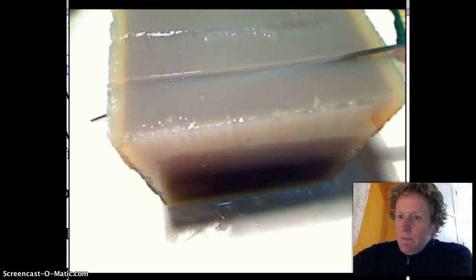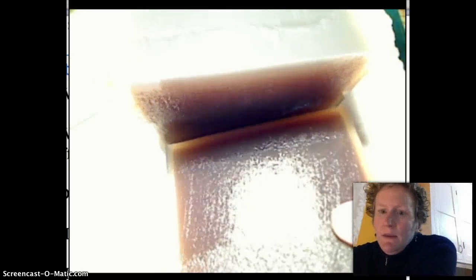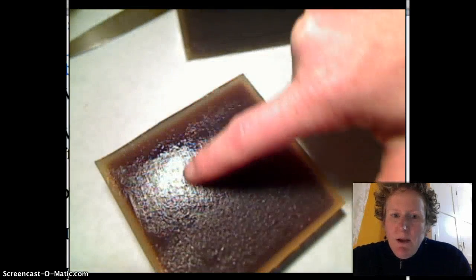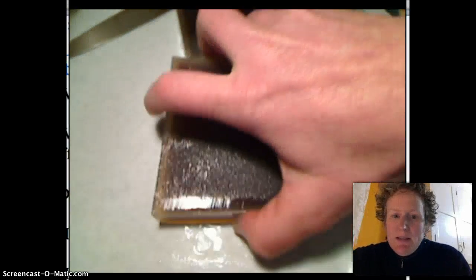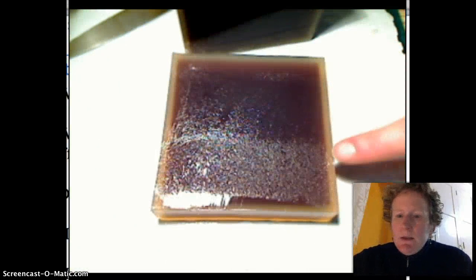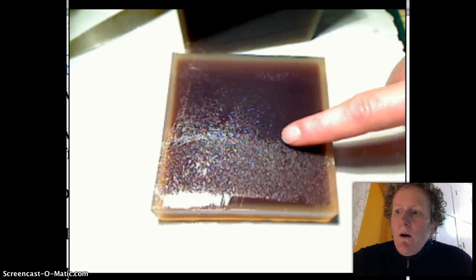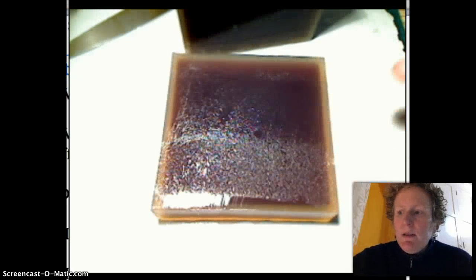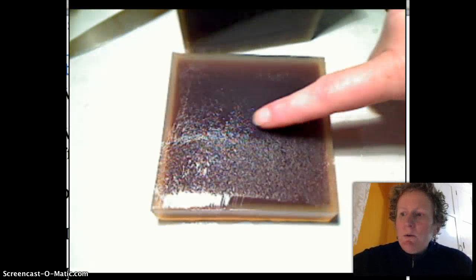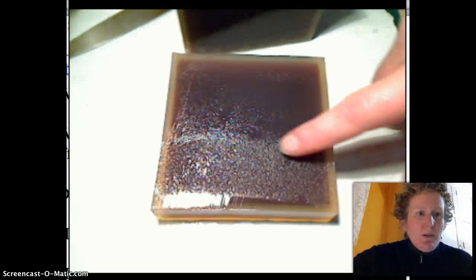I'll cut into this big giant cell, the Texas cell here. And you can see that only a little bit, the outer edge of this giant 10 by 10 by 10 centimeter cell, there's only a little bit of diffusion around the cell. So it's going to take a long time at this rate of diffusion to go all the way across the cell into the middle. And if this was oxygen or carbon dioxide coming out or oxygen going in, the cell would take a very, very long time to diffuse those materials.